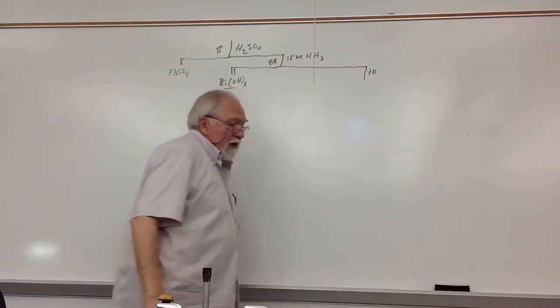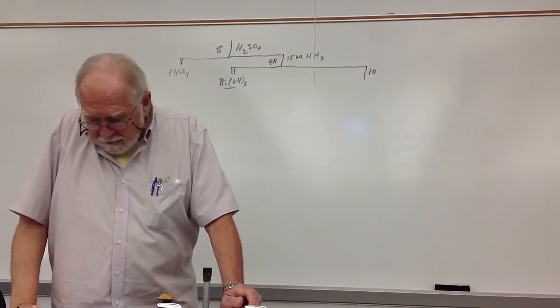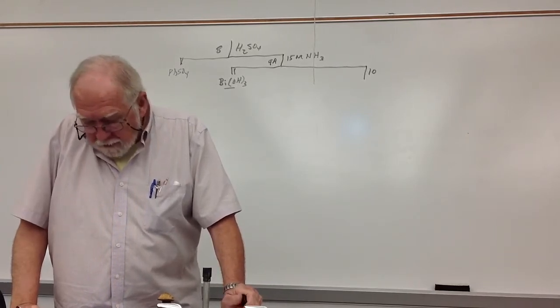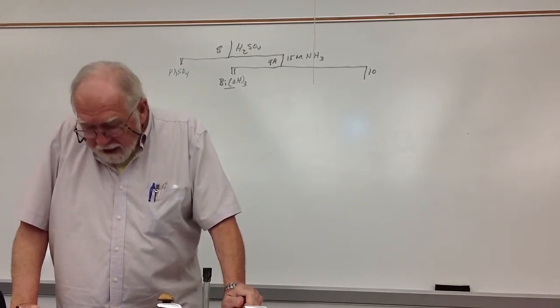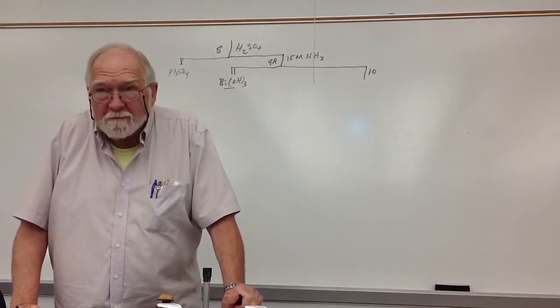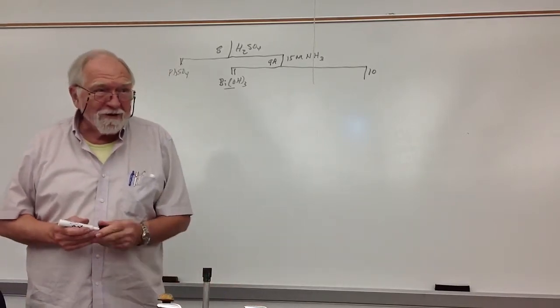And it's going to break down, so this is the one I want to read to you carefully. But let's finish this one out because this is about where I left off. Wash the precipitate, hot water. To the washed precipitate, you add sodium hydroxide. It says 8 molar. There's only 1 bottle of sodium hydroxide back there. That's the sodium hydroxide you use. It is 8 molar. Okay?